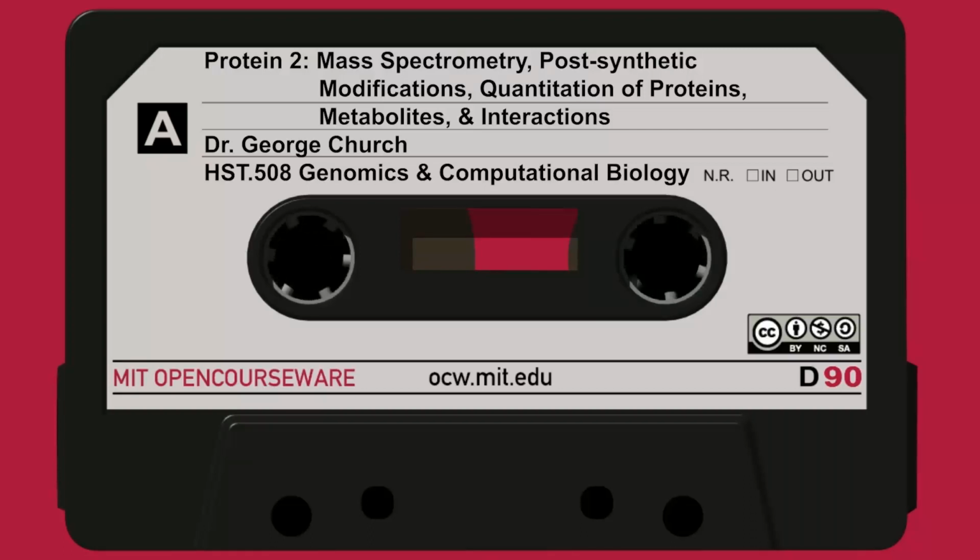Now, size tells us something about the stoichiometry of protein-protein interactions when we're looking at native measures of size of complexes. And other indications of specific binding, whether it's between proteins or protein and a small molecule, can be detected by affinity chromatography. Another related method is immunoprecipitation, where you'll have one ligand, like an antibody, which is specific for a particular protein epitope, and will pull down all the proteins that are associated with that epitope, that surface property. And then another sedimentation method.